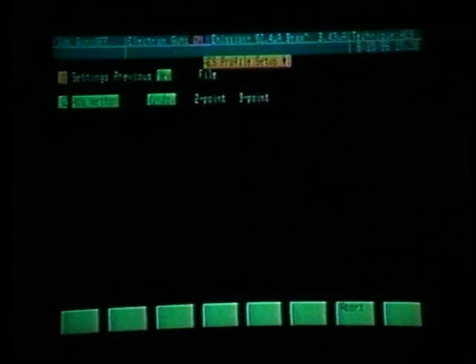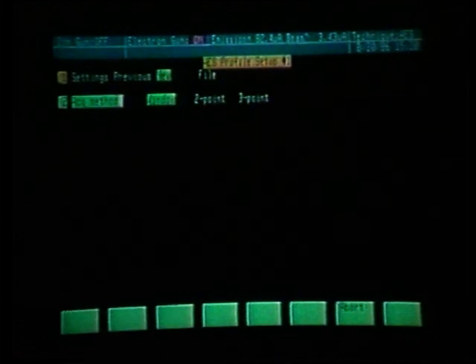For example, a window which is 30 electron volts wide, and we are looking at 1 volt per step. That is 30 data points per window. With a 2-point profile, we are only looking at 2 data points. If we need to, for example, go 3 sweeps on the window, that is 90 data points.